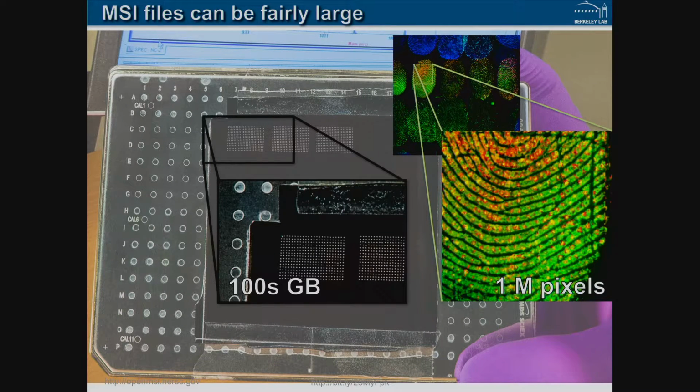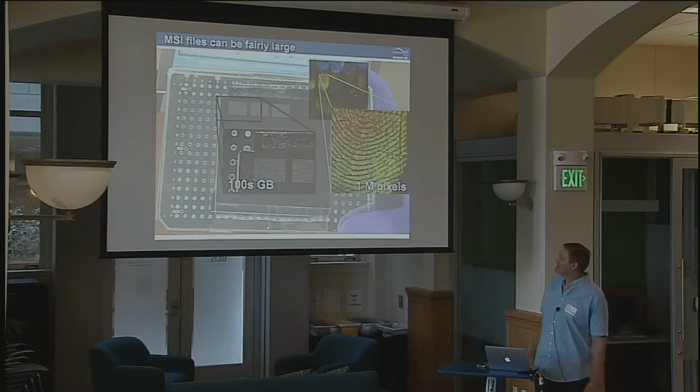So these files can be just ginormous, is the proper term for it. This is the printed samples I was telling you about earlier. This is an experiment where 3 of us went around and touched different chemical surfaces and then touched the mass spectrometry surface. And this file is literally a terabyte for one file. So 1 day's work, 1 terabyte.